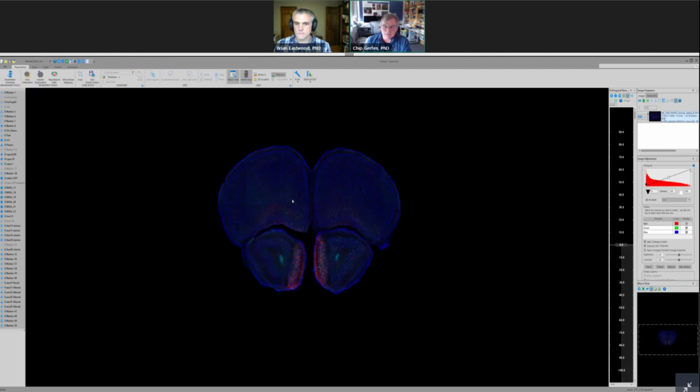Hey Chip, are these sections also 50 microns? Yes, these are all 50 microns.